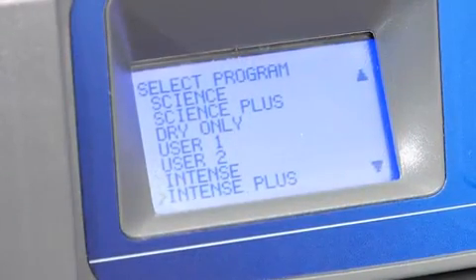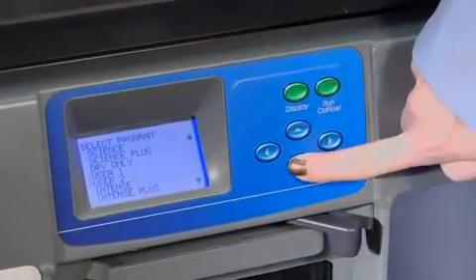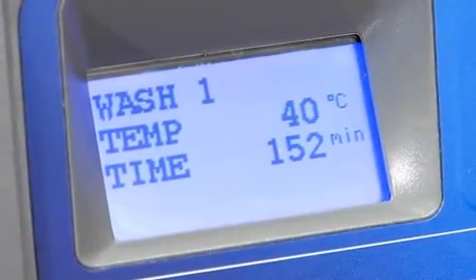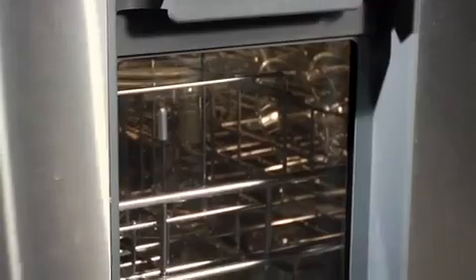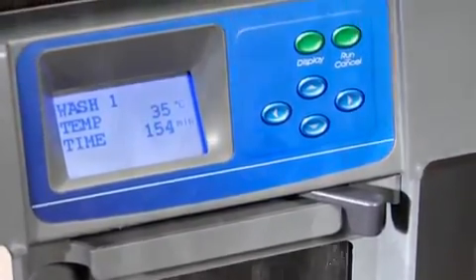Flexible cycle programs let you choose from up to 10 factory preset and two custom design programs. A dry cycle from 0 to 250 minutes is standard on all washers, and the Vantage includes a HEPA filter to remove airborne particulates. A dry only cycle is also available. Up to six rinses, either tap or pure water, per program ensures water-soluble contaminants are removed.